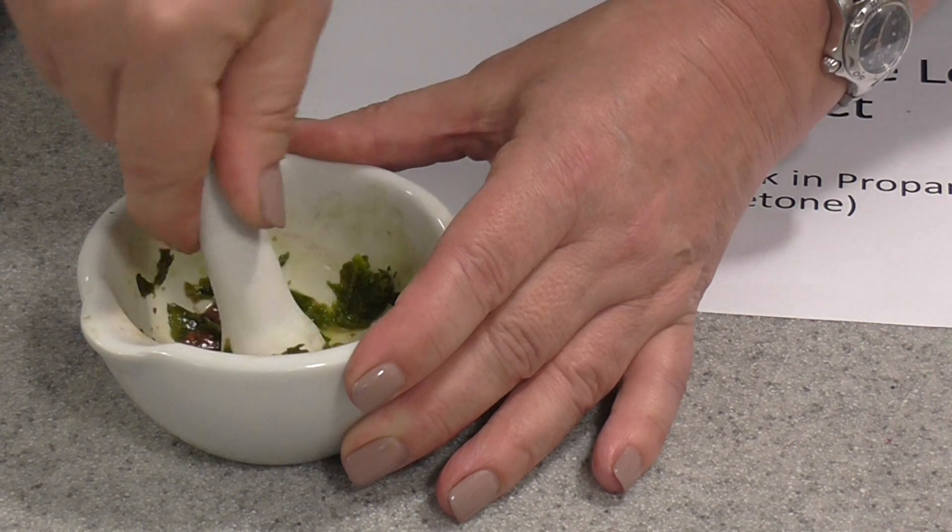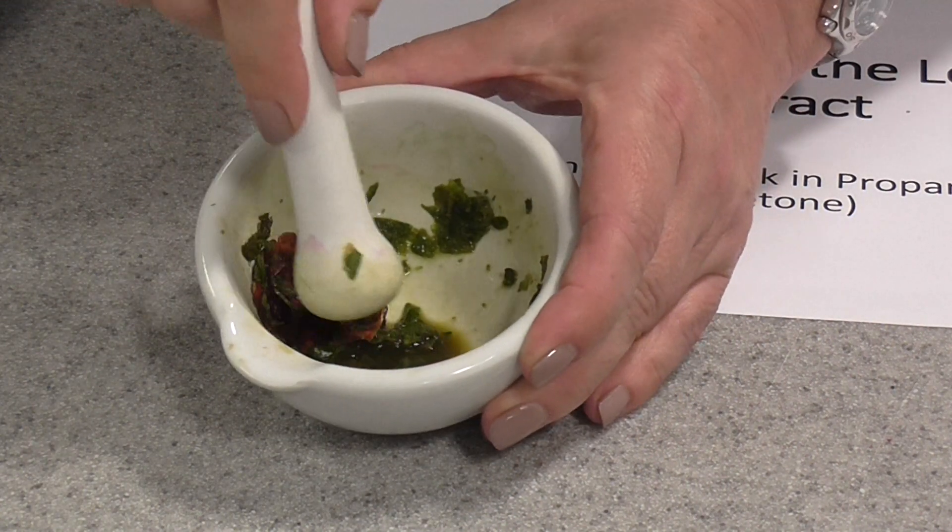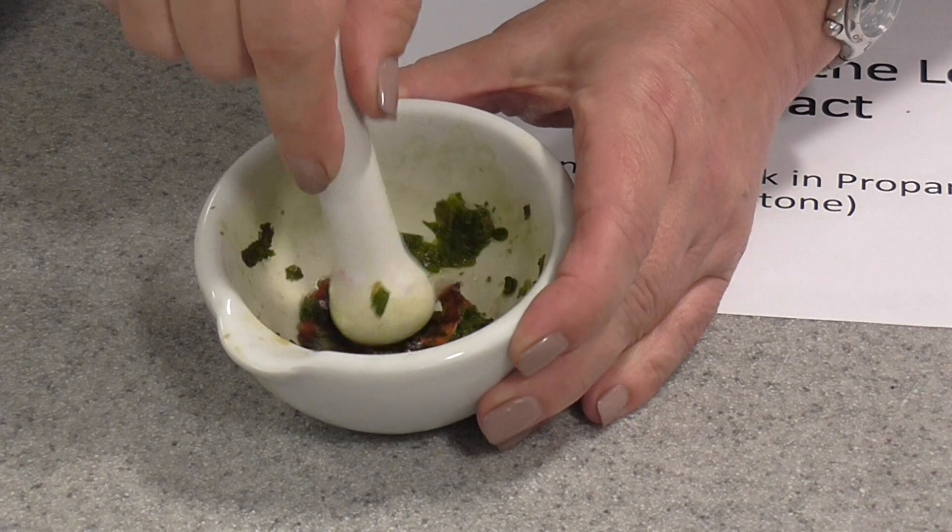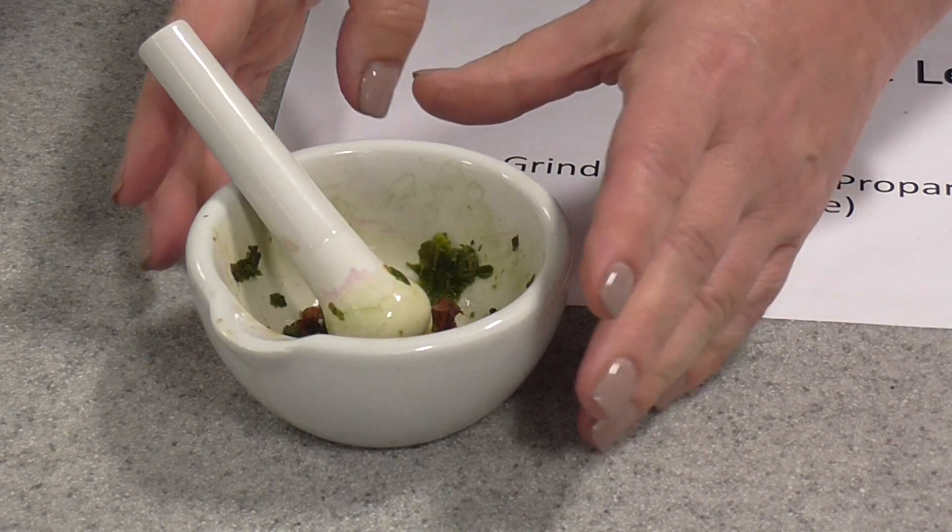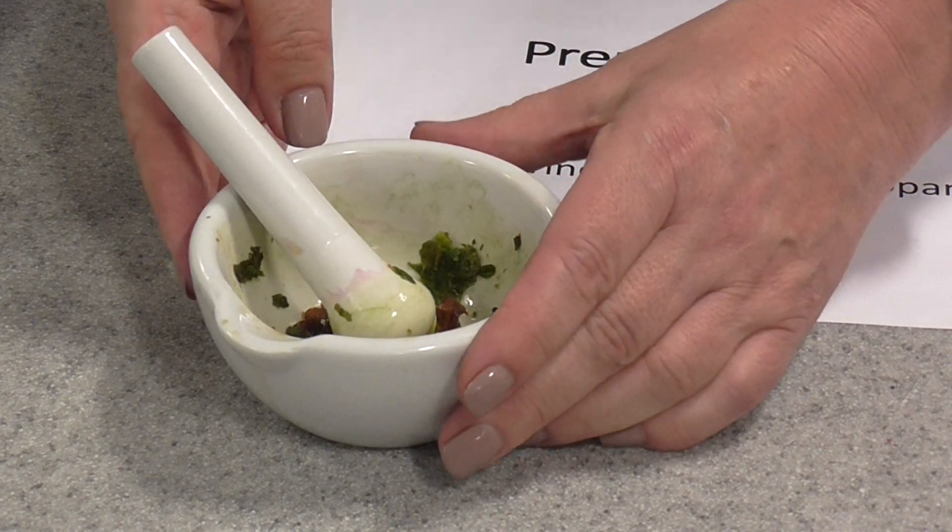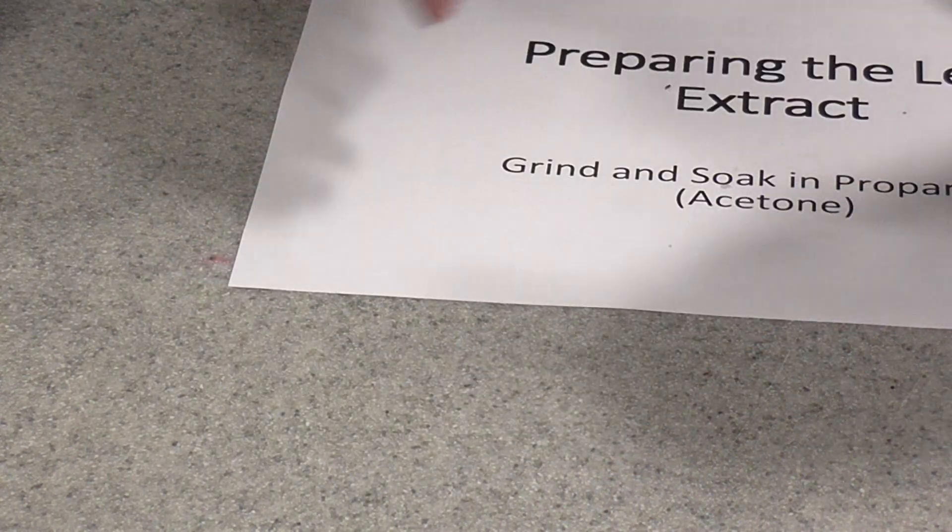You'll see that the pigments start being released into the liquid at the bottom there. This works a little bit better if you then leave that to soak for a few minutes. So it's a good idea to do that first, and then put that on one side while you prepare your TLC plate.